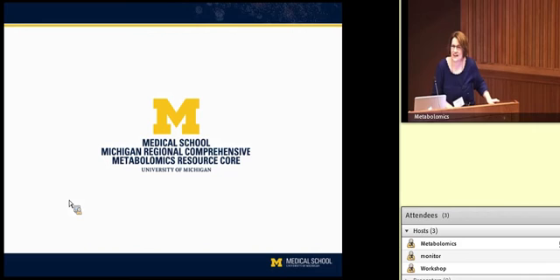I was wondering how you align the retention time across runs, because the retention time shifts across samples over days sometimes. Right. For a targeted assay, when you're looking at a limited number of things, a little bit of retention time drift is not necessarily going to concern us. We know the retention order as well, so we know the approximate spacing. Even if there's a little bit of drift in one direction, all the samples have drifted in that direction, all the compounds we're looking at. So usually the relative spacing between all these compounds is the same.